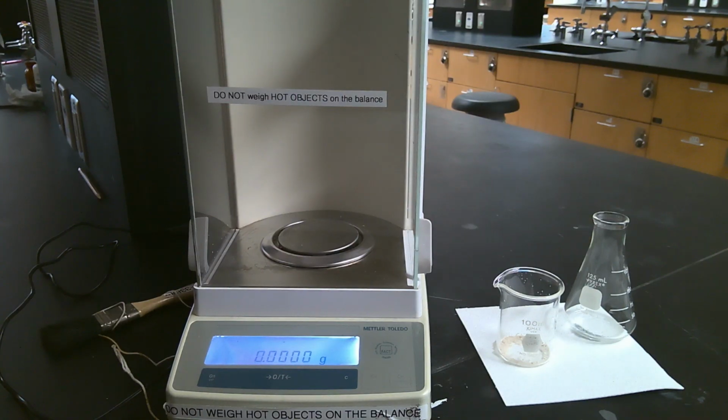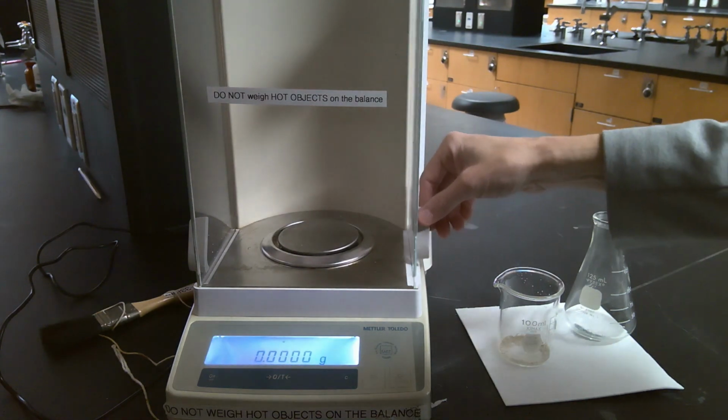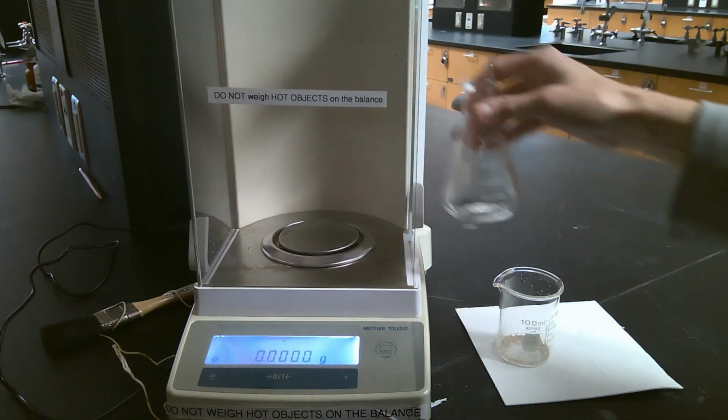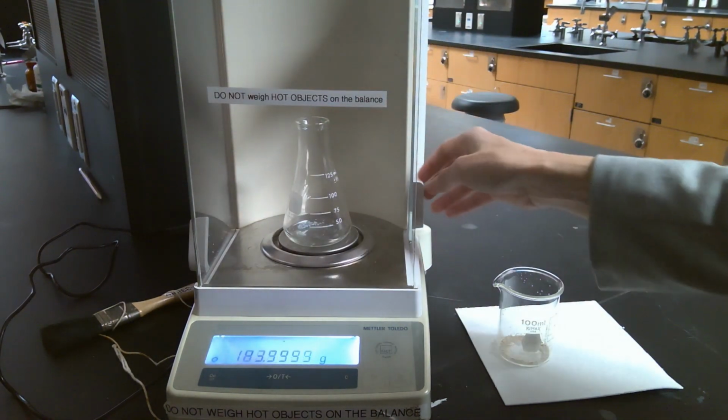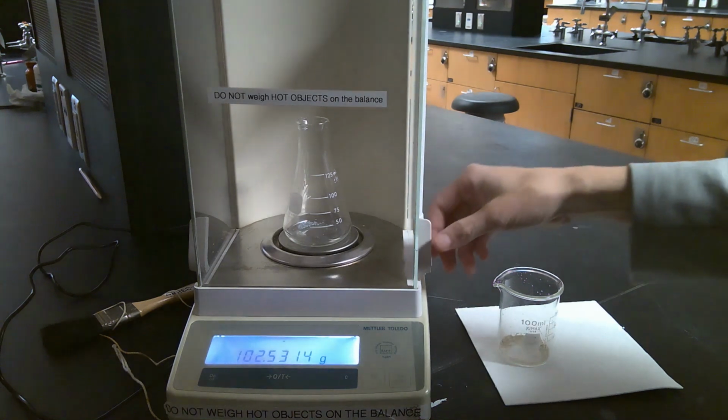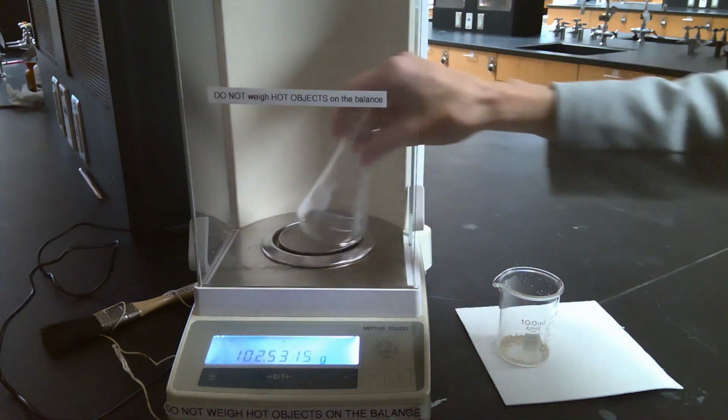Now that the flask and the beaker have had an opportunity to cool, I'm going to obtain their masses. So first, the Erlenmeyer flask that has our solid zinc in it. Alrighty. I'm going to switch this out.